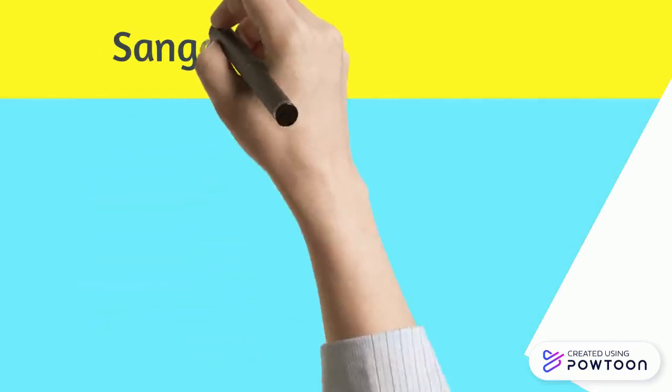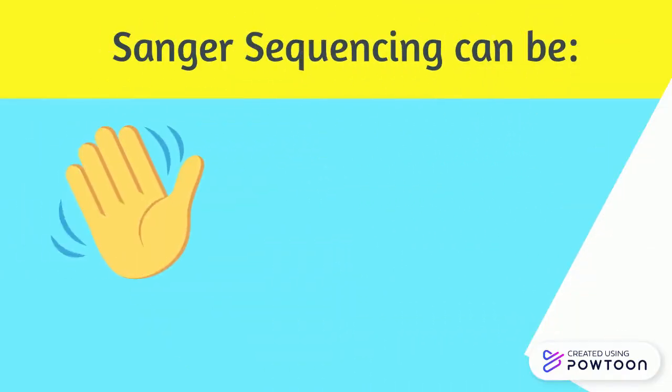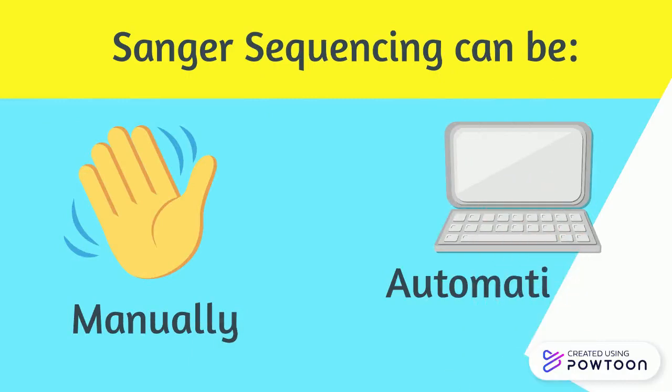Finally, it's worth mentioning that Sanger sequencing can be conducted either manually or in an automated manner.